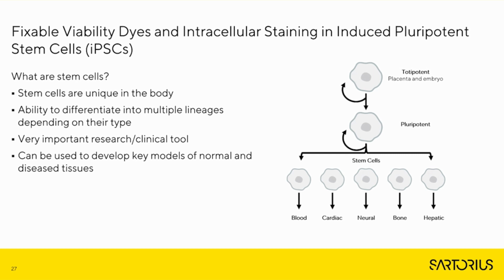So if we take a look at the fixable viability dyes and intracellular staining, again, we can also look at this in adherent cell lines. So for this particular case study, we used induced pluripotent stem cells. So I'll give a brief overview of what iPSCs are.